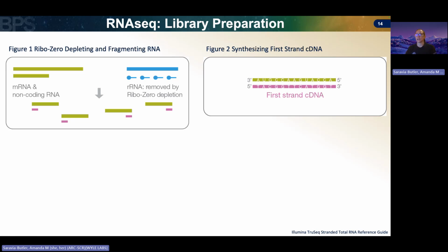We do this using the enzyme reverse transcriptase, which we hijack from viruses, I believe, to be able to use this RNA template that was derived from our sample to generate a complementary DNA strand. Keep in mind here, although we do see a sequence here, at this point, we do not know what this sequence is.